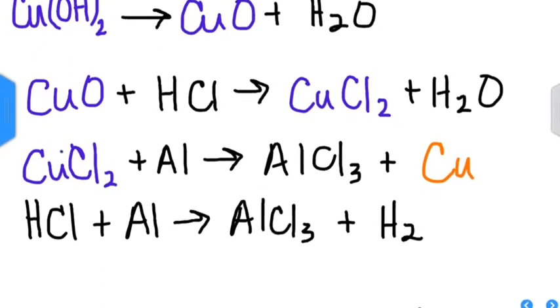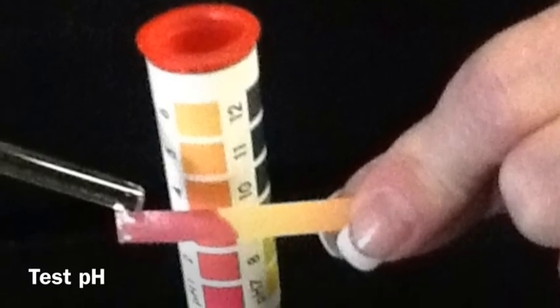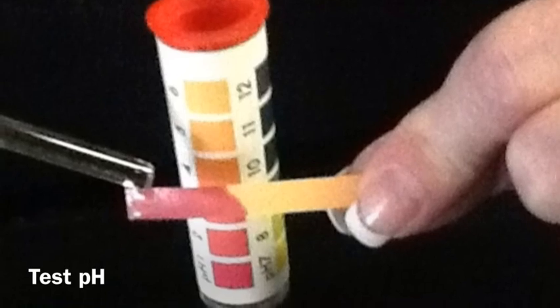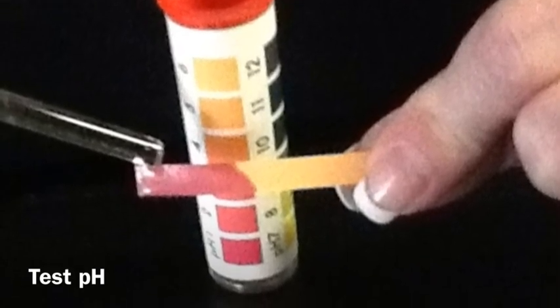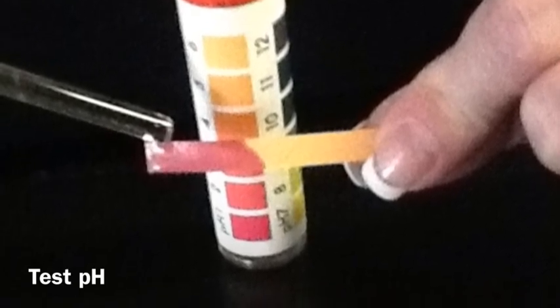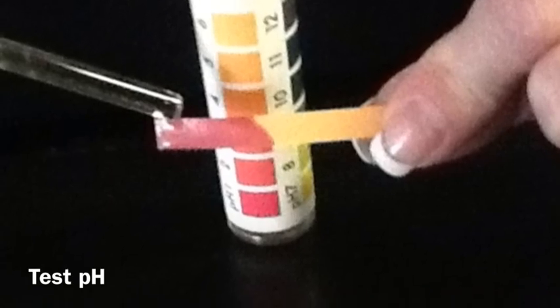Low pH numbers indicate high acidity, and then lower acidity is indicated by higher numbers. So your original pH should have been fairly low, and if you retake the pH again, because the solution is no longer as acidic, you should have a higher pH number.